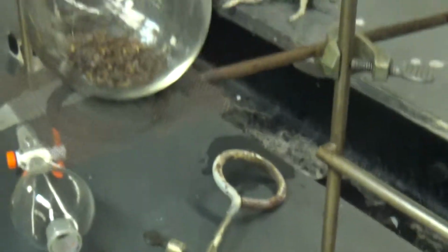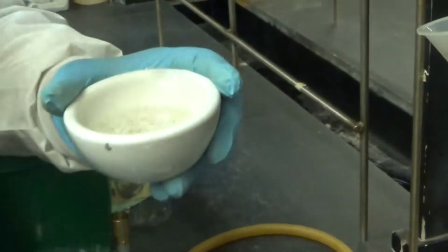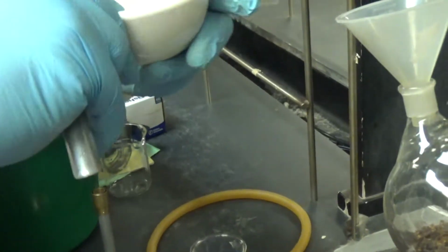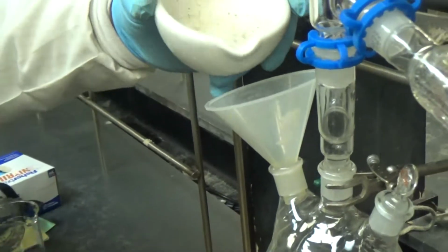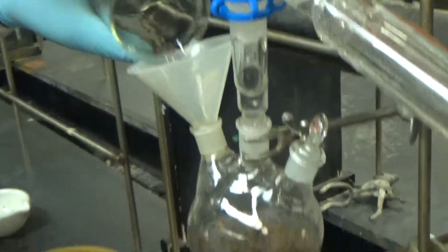Okay. Alright, the cloves are in the flask. You're going to wash it over with some water. Not a problem. Alright, so most of it's washed over. And then just pour the rest, 150 mils total of water.